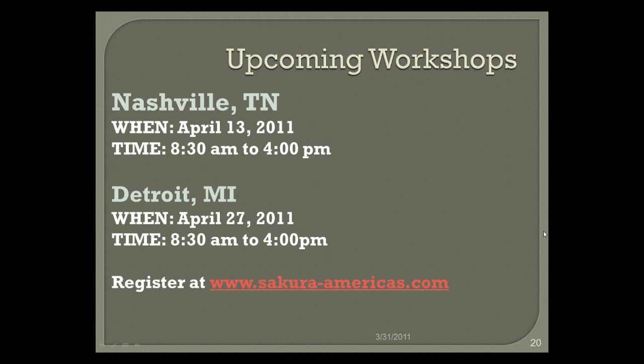Thank you. Next question is, please tell me what the label should be on a formalin container concerning hazards. Okay. So concerning hazards, I'll repeat it one more time, and I will direct you to where to purchase some of these labels. The labels should have the following hazards: potential cancer hazard, irritation and sensitization of the skin and respiratory system, eye and throat irritation, and acute toxicity.